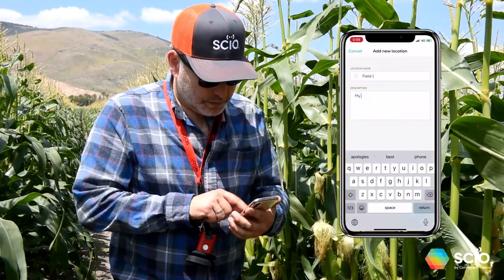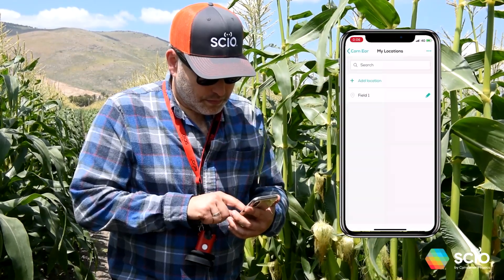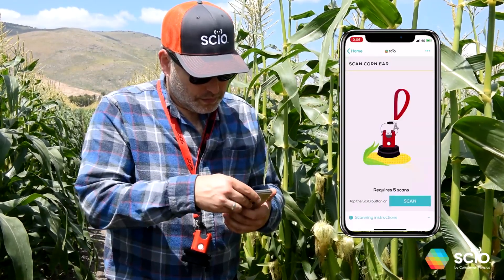If it's the first time scanning in this field, enter the name of this field. Next time you scan in this field, select it first.